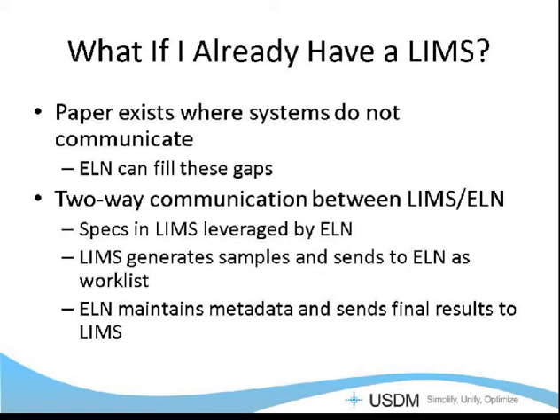You do the testing. You re-enter your results in the LIMS. If the samples could be sent from LIMS to your ELN, and you could record your testing in there and the results go into LIMS, there would be no paper. So anywhere where you see paper in the lab, chances are you have systems that are not talking to each other, and this is where you want to look to see where you have opportunity to make those connections.